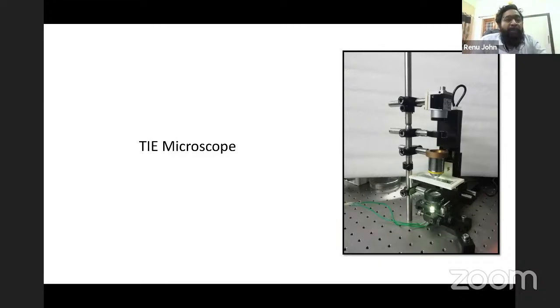For microscopy, the area of the object is really small. So for such small regions, these sources could really work as coherent sources. So we could assemble this system, which is a microscope that has probably many more features than the expensive microscopes and confocal microscopes that you see in clinics now.